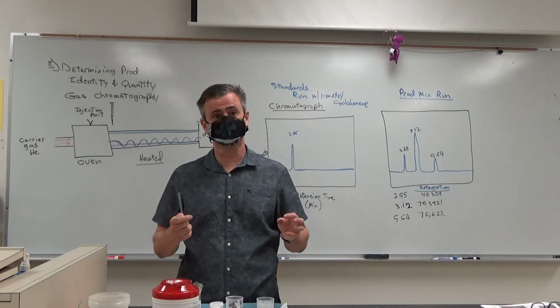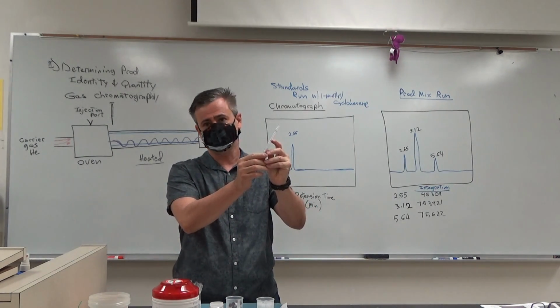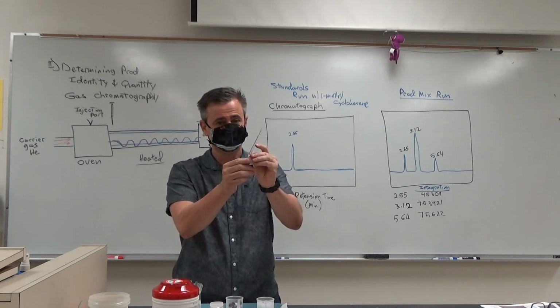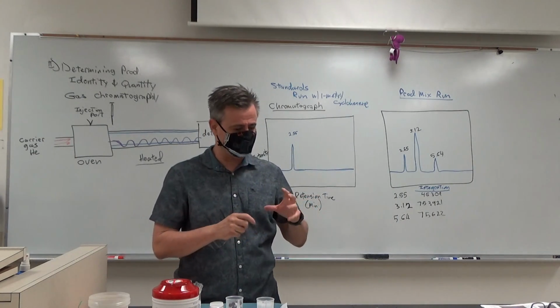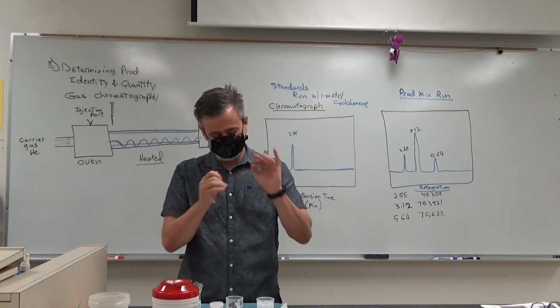Probably a better visual thing is you want about 1 inch of silica gel. Inch and a half. That's a better visual. I should change that. Okay? I also say roll up some weighing paper to create a makeshift funnel. Yeah, it's not the greatest.